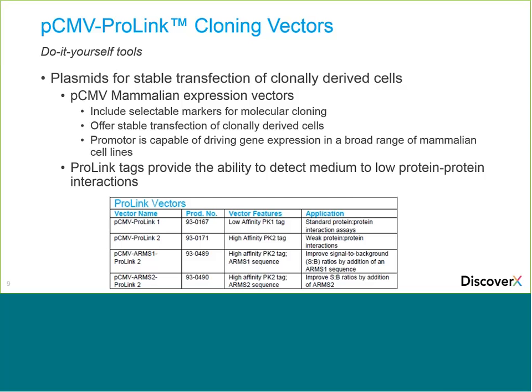All right, so let's move into looking at 4 different applications for beta-arrestin recruitment. I've listed about 8 of them here. There are additional ones on our website if you need that.